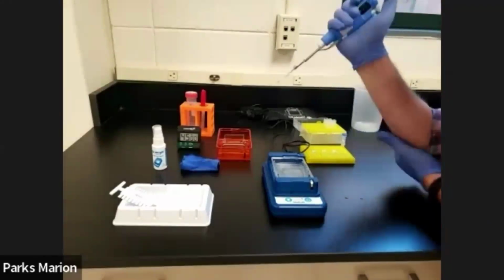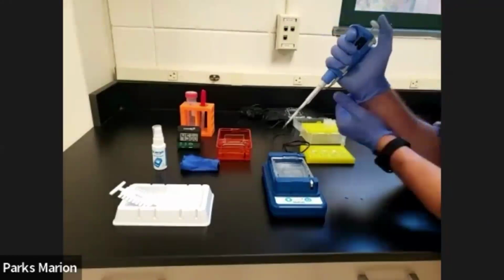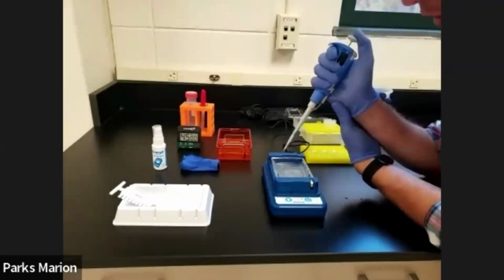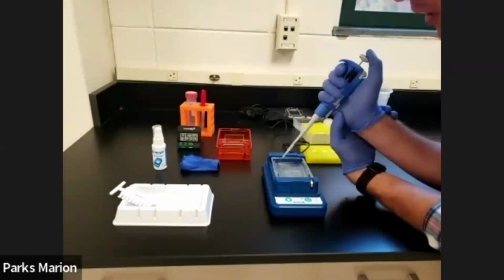As you do this, you want to stabilize your elbow on the table so it's nice and secure. Make sure no one's shaking the table. You can use your second hand for extra stability. And then you're going to place the pipette tip into the well.